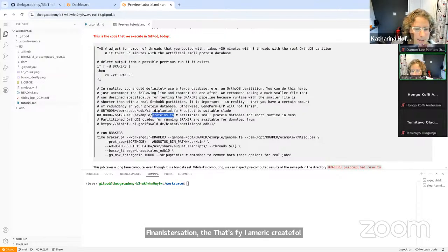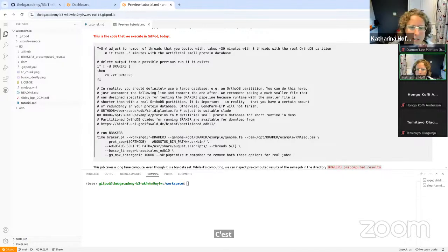Trying to remember who did that. One of the really amazing people from the Cesky Krumlov workshop did it. I'm so sorry that I cannot give proper credit right now. This is not our data set. Anyway, this is a custom artificial small fake data set that we're using today. In real life, please use a big data set.